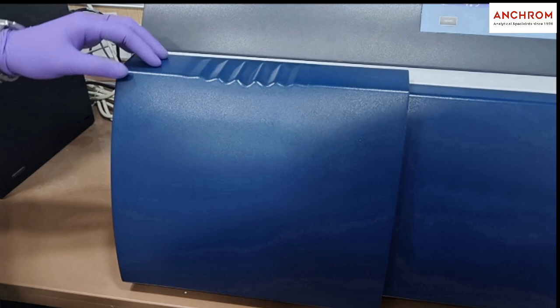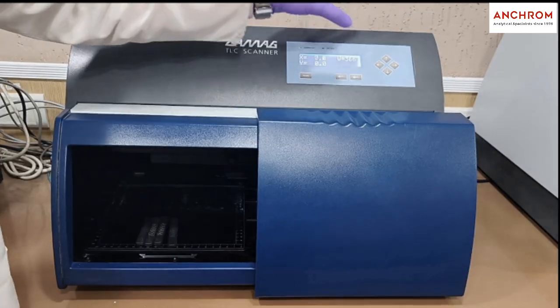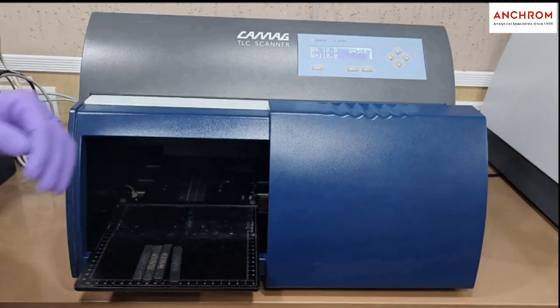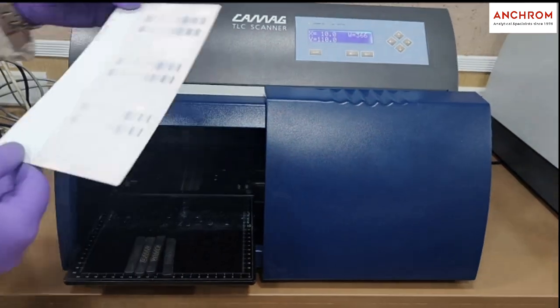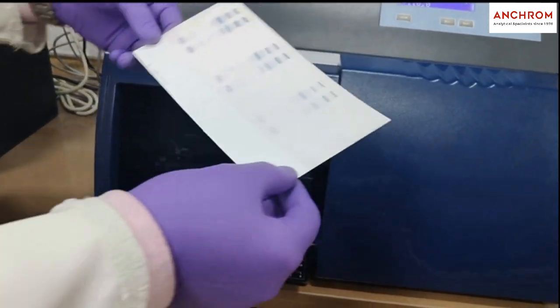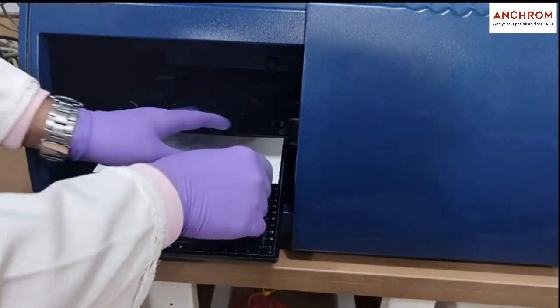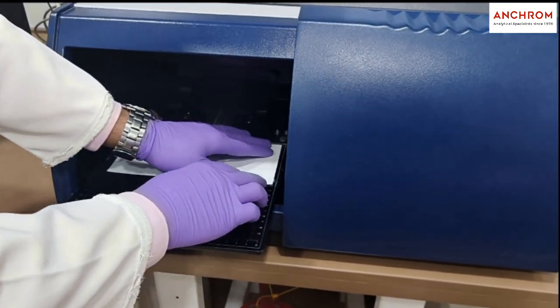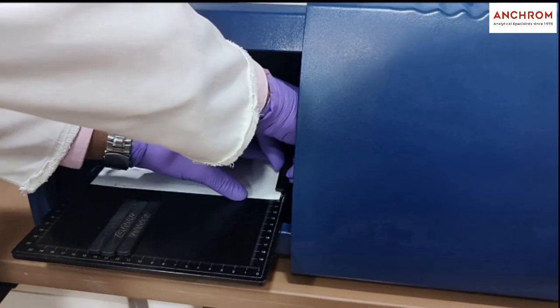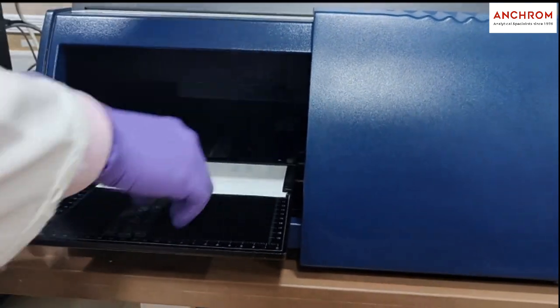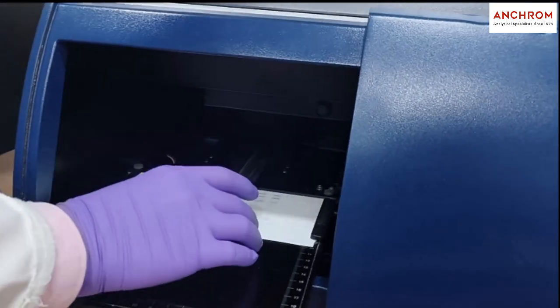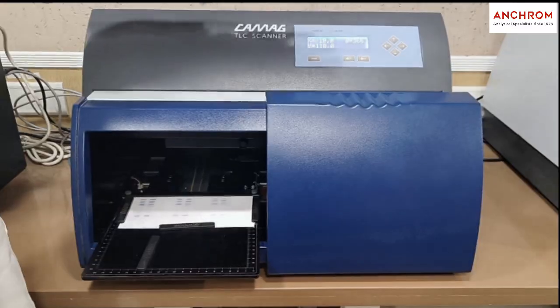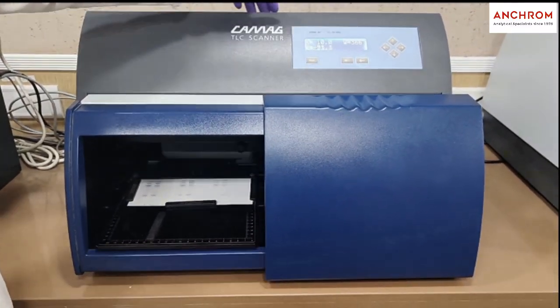To operate TLC Scanner 4, open the door and press the load button situated on the top right side. The stage will automatically come out. Keep the TLC or HPTLC plate on the stage and fix it at the bottom left corner inside the Scanner 4. Press the load button.